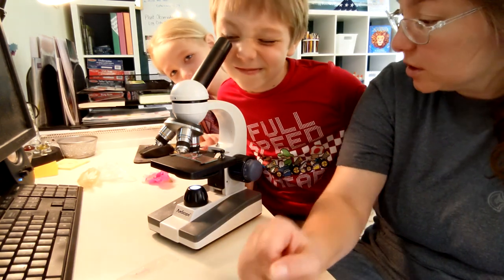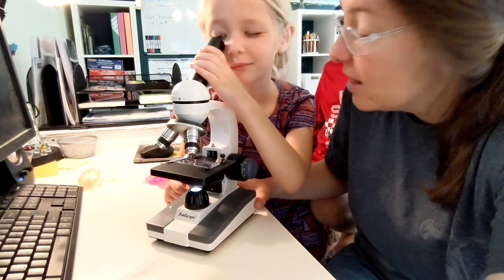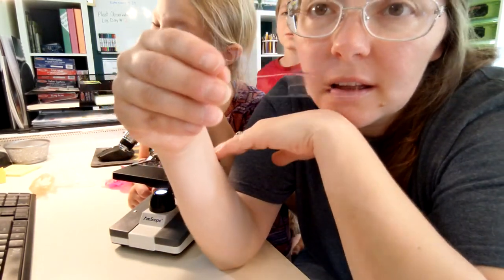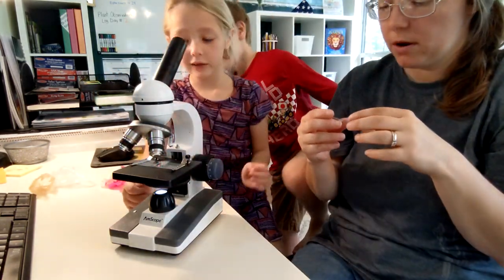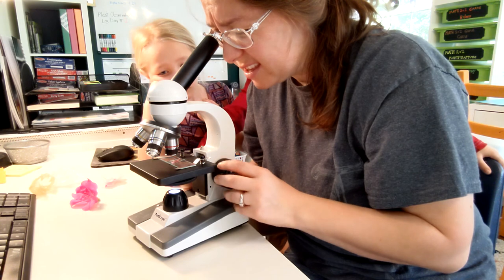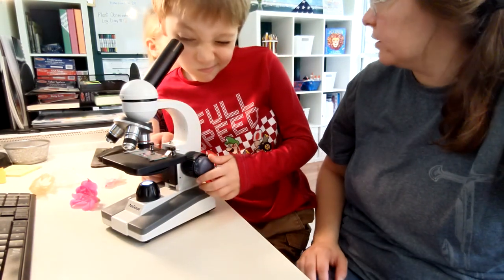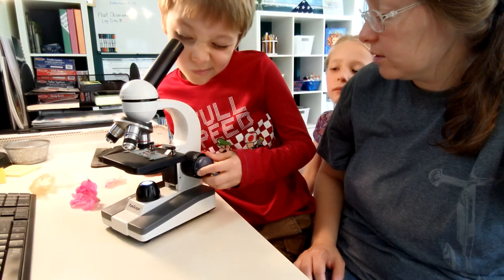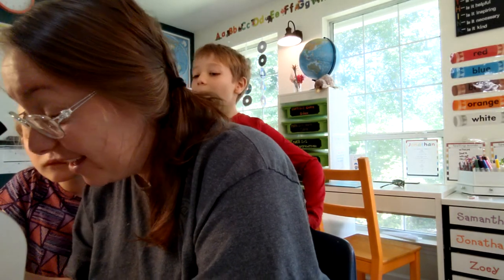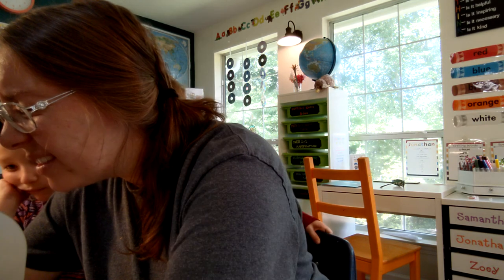Isn't that cool? So it took something very tiny and made it really really big. This is our first time using the microscope — I think it's going pretty well, they seem pretty interested in it. We made our own slides of a stamen from one of our flowers from our yard. These make it clearer — if you move this it goes up and down, to make it more clear or less clear. Don't go too far. Whoa, how cool!